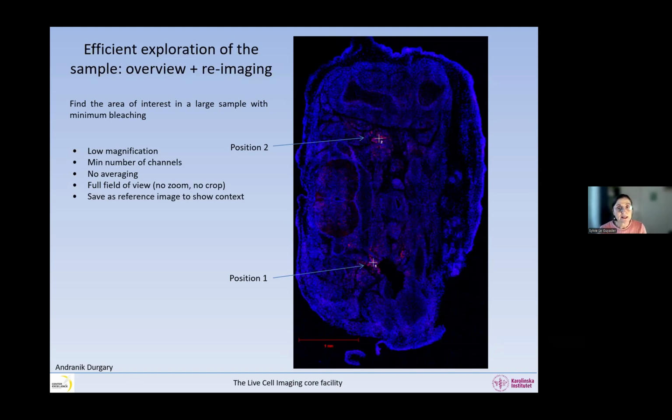And then we can save this image as an overview to then show, I've imaged this at high resolution here, I've imaged this at high resolution there, over a little bit of the slide.